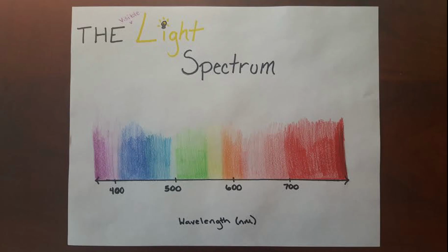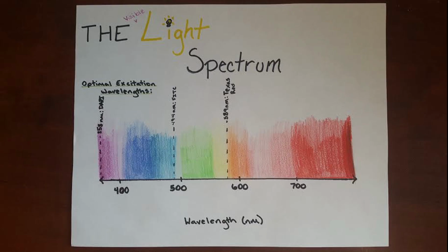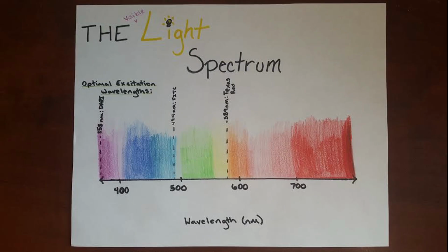You may remember that light is not just the white-yellow light bulb that we see. It's an entire spectrum of wavelengths, and certain wavelengths excite fluorophore electrons more so than do others. So how does a fluorescent microscope excite fluorophore electrons, and what's the purpose of doing so? As I mentioned before, each type of fluorophore is excited most by a specific wavelength of light.